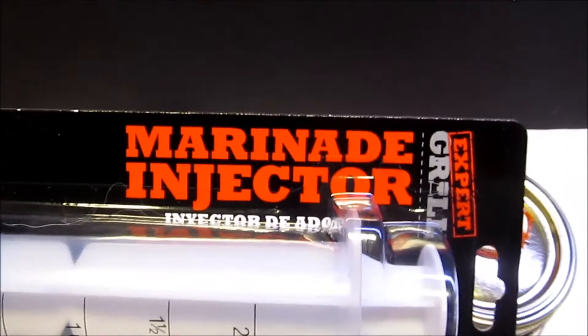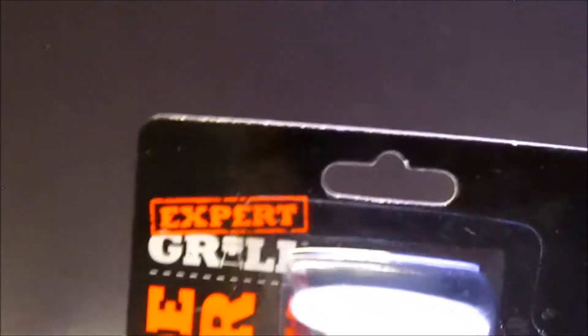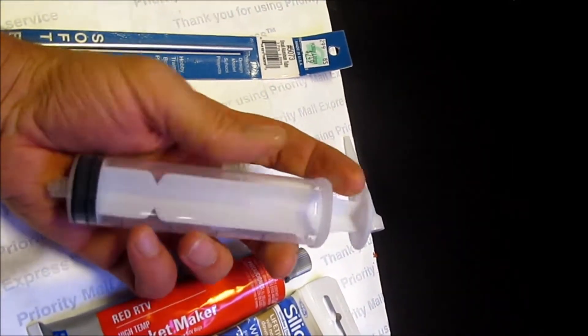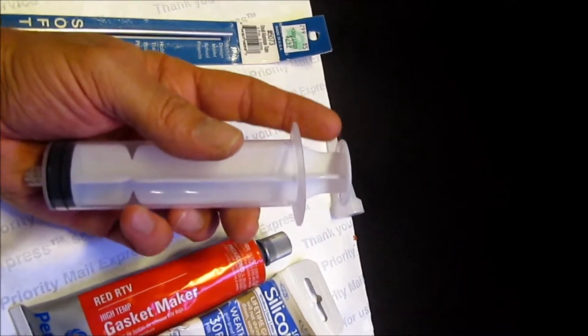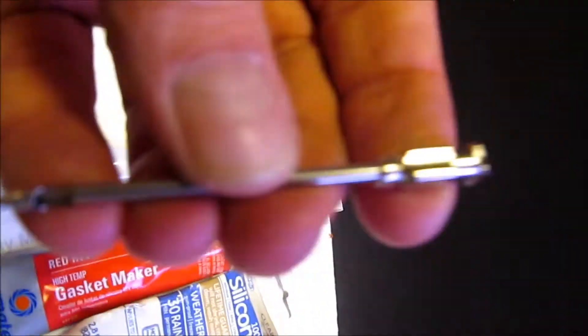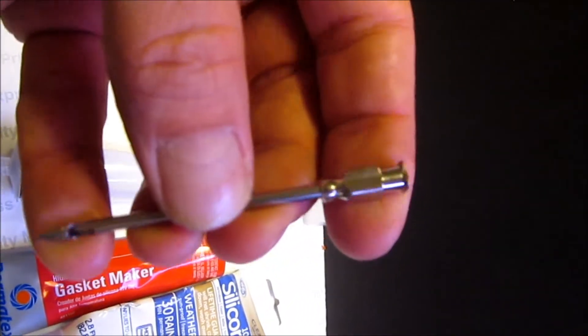The marinade injector from Walmart, in the barbecue aisle, 88 cents. Not only is it a giant 60cc syringe that'll go through the pressure cooker, it also comes with a really big needle that has a lot of uses. We'll get to that too.